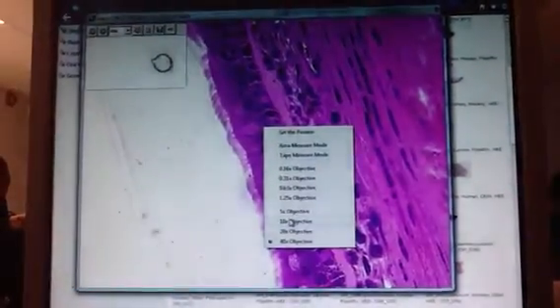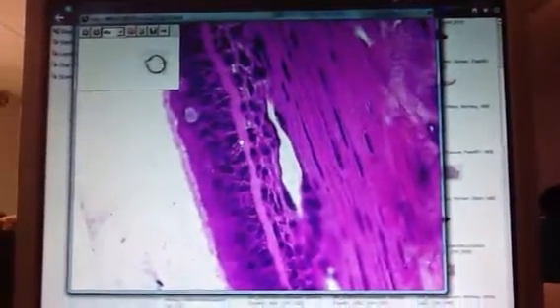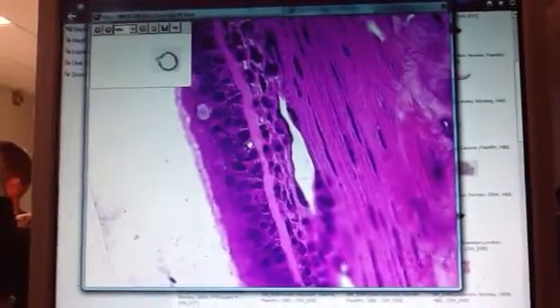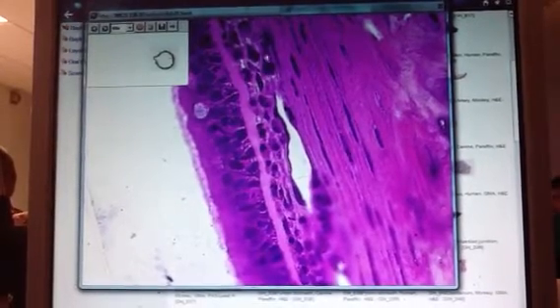Alright, so we look at a lower mag. Here's this. The epithelium, actually, let me go up again. The epithelium extends from right here, the dark purple, not this pink stuff, this is the basement membrane here. So here's my epithelium. All this below is another tissue.